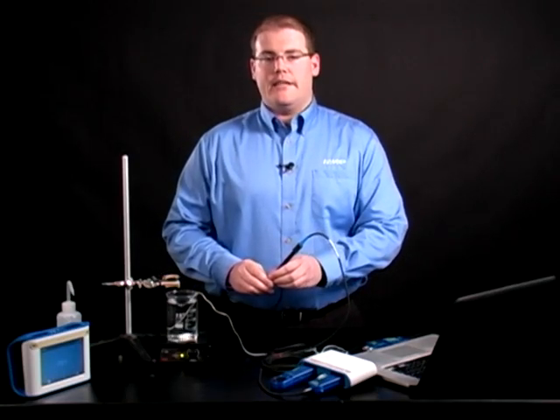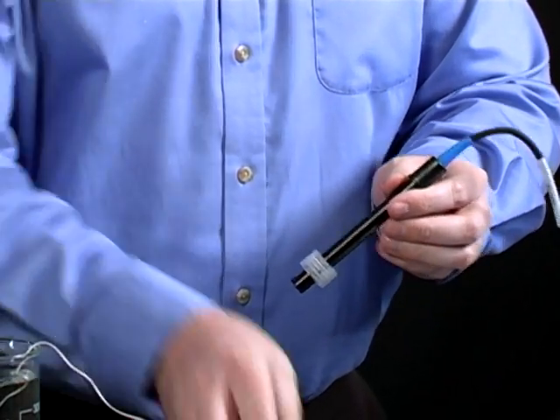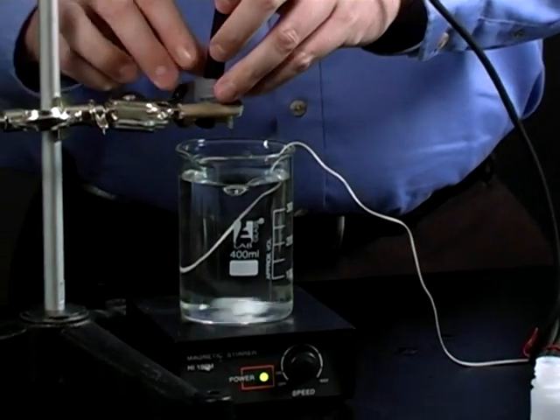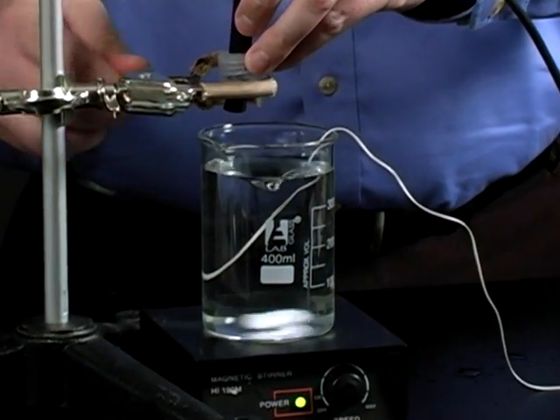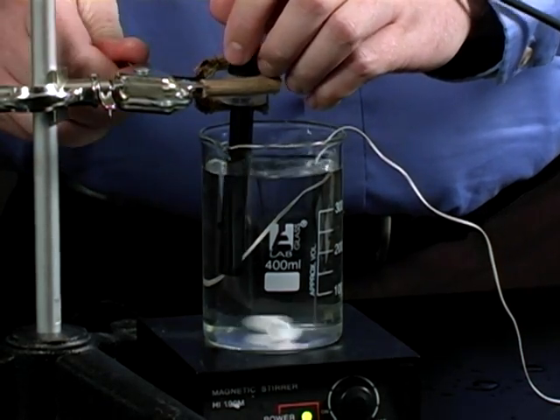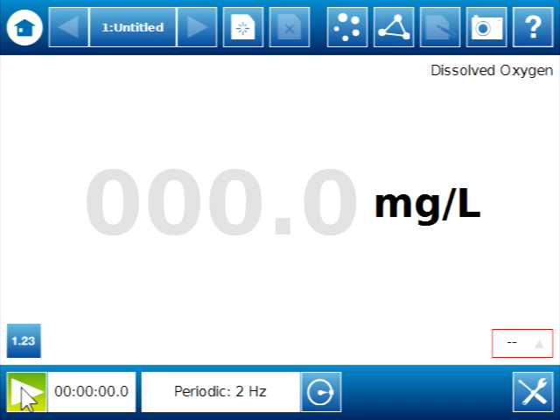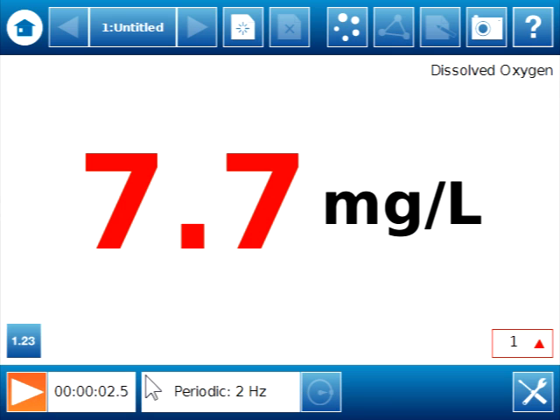We are now ready to begin collecting data. Remove the probe from the storage bottle and place it into your water sample. Again, making sure that it's submerged below the silver ring on the probe if it has one. Press start to begin collecting data, and you are ready to go.